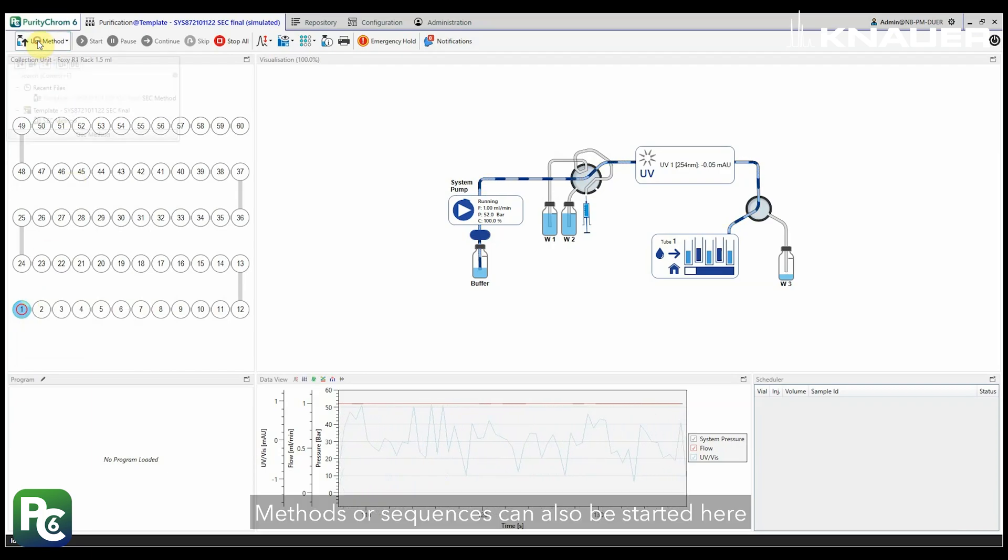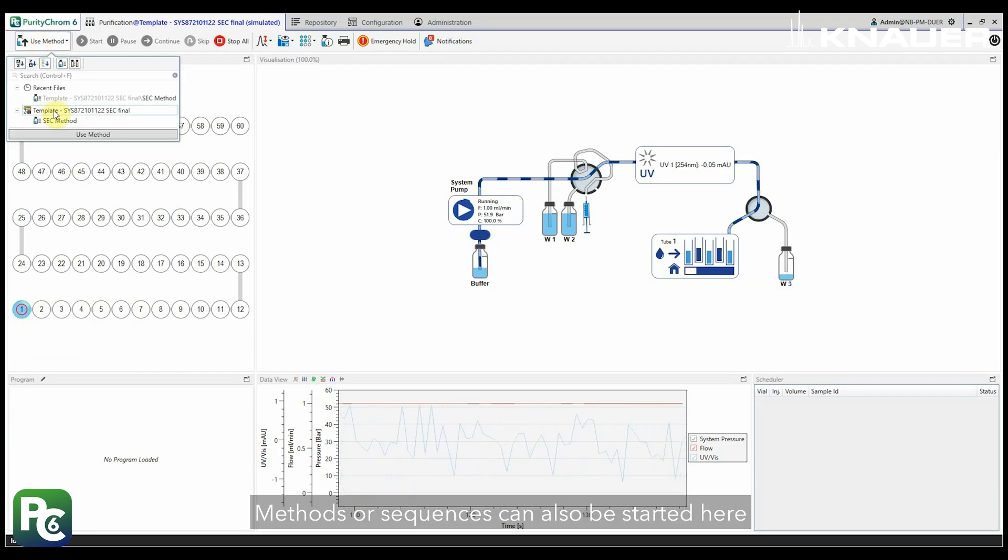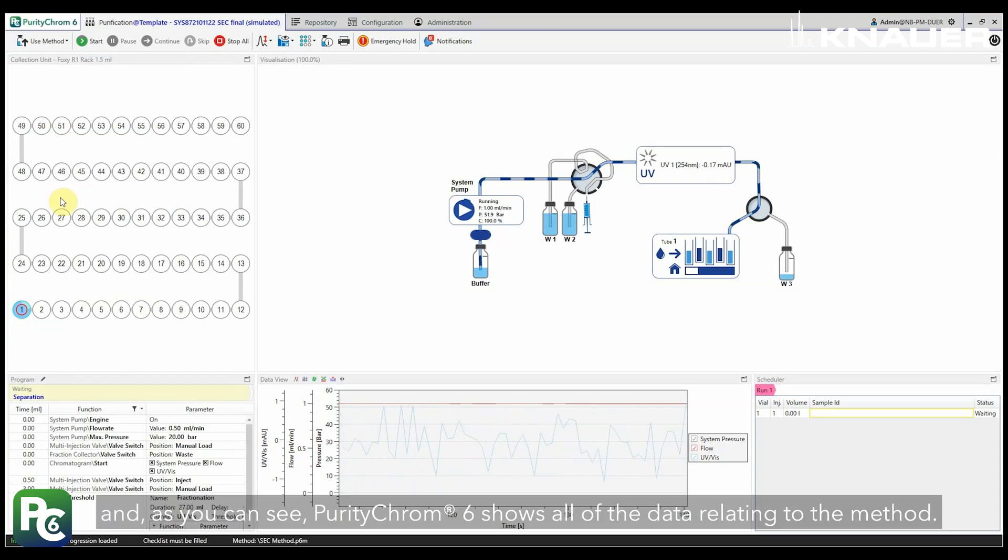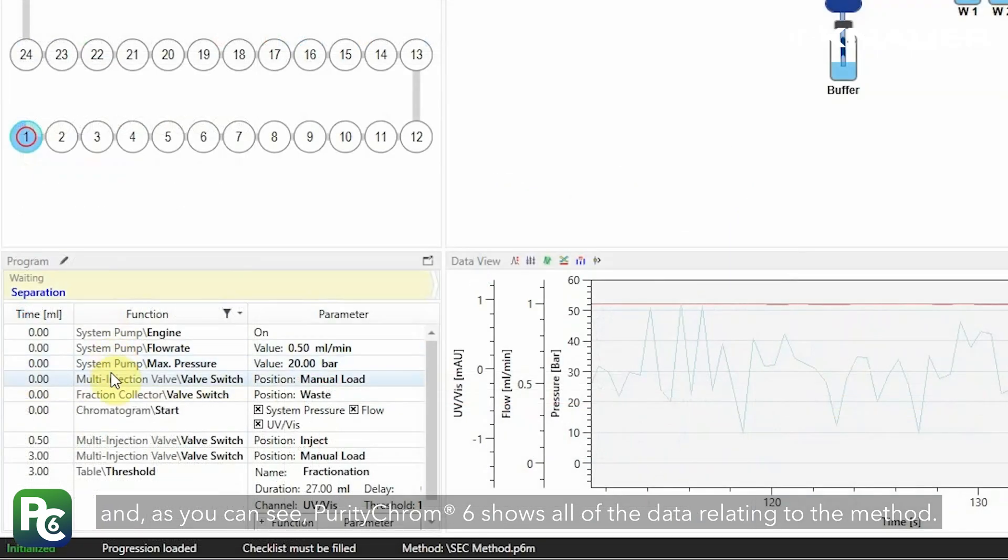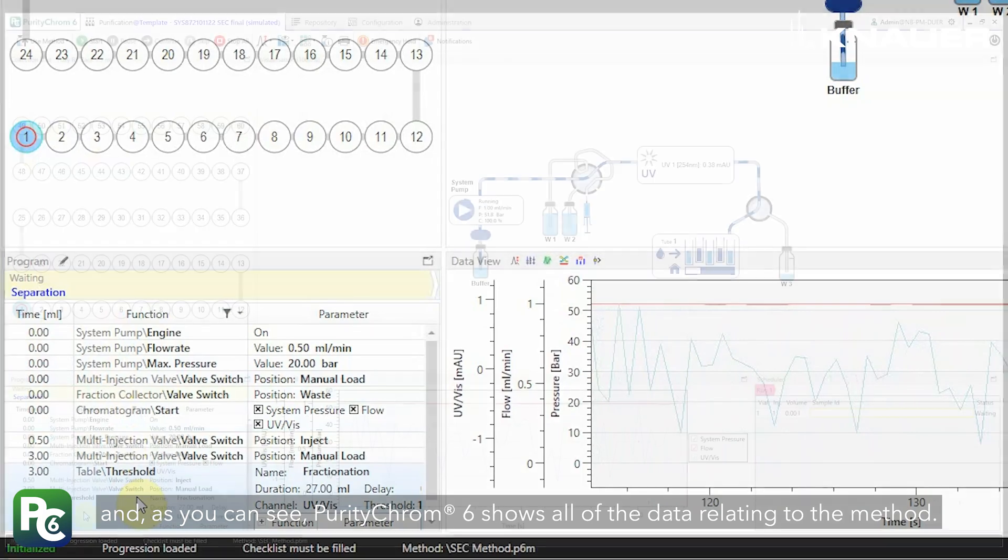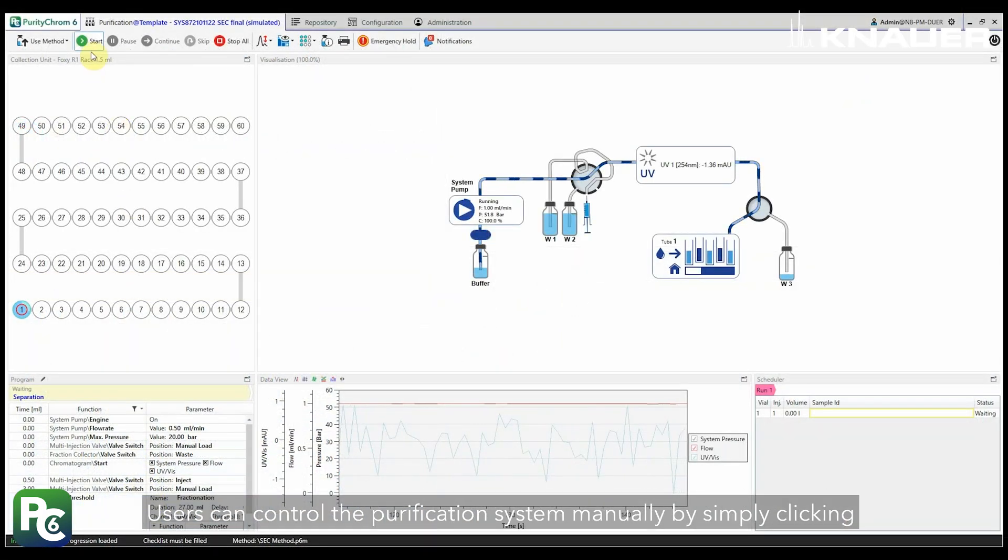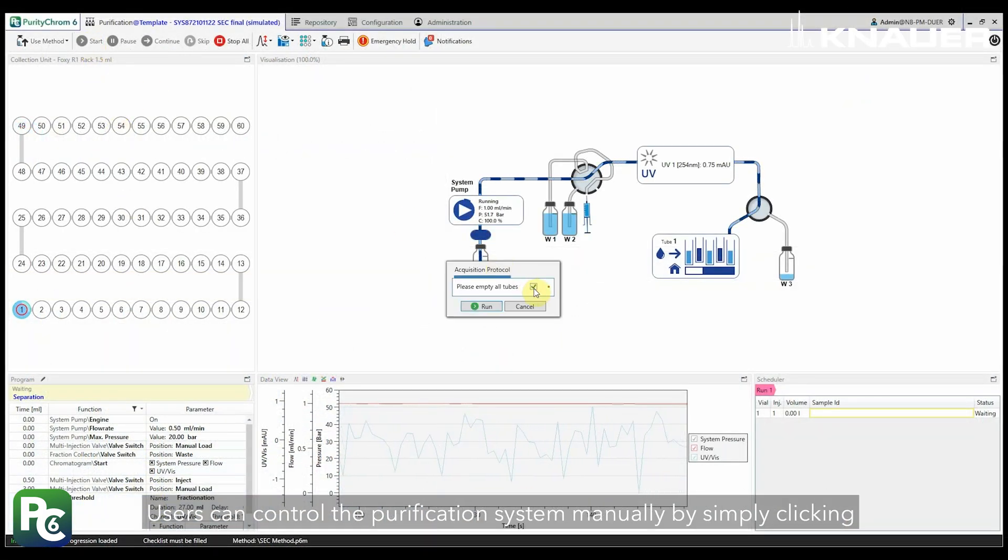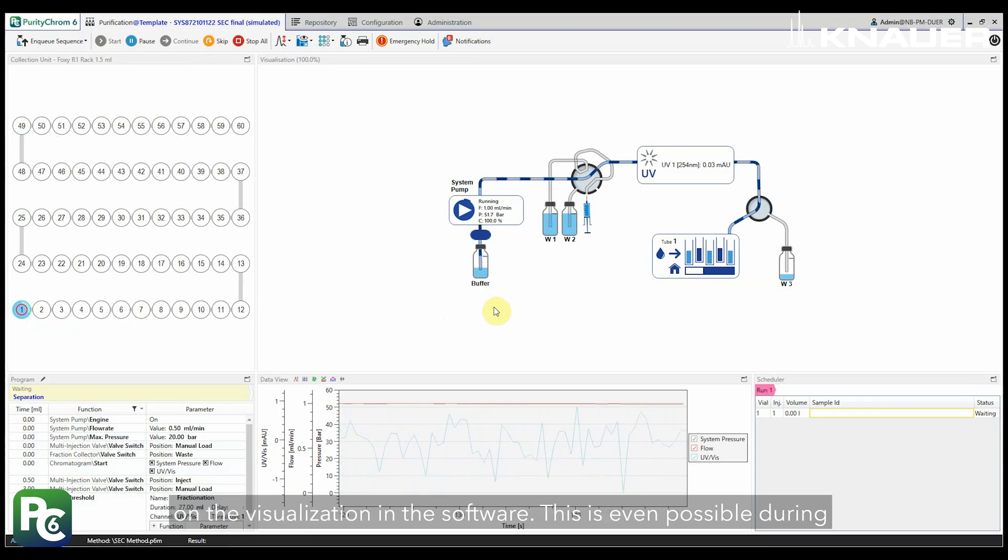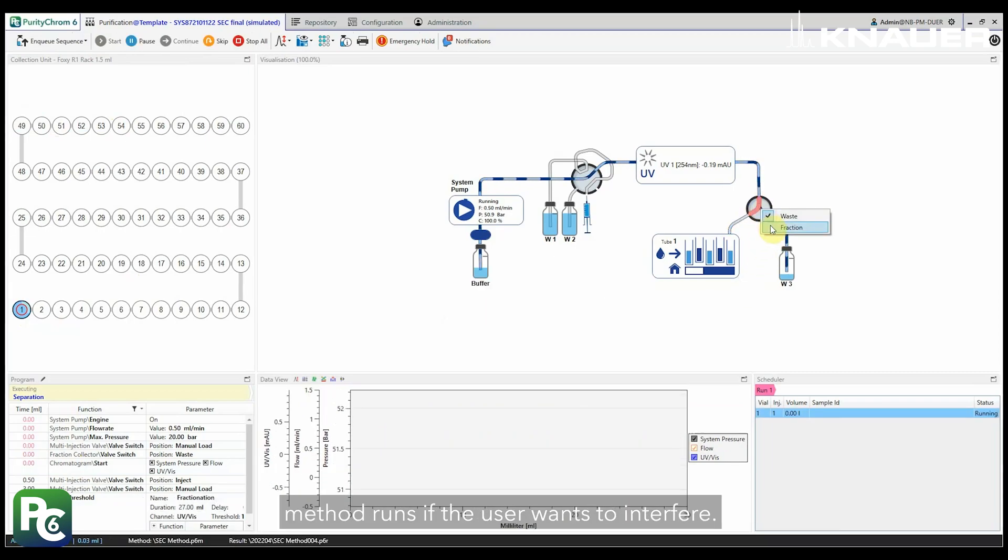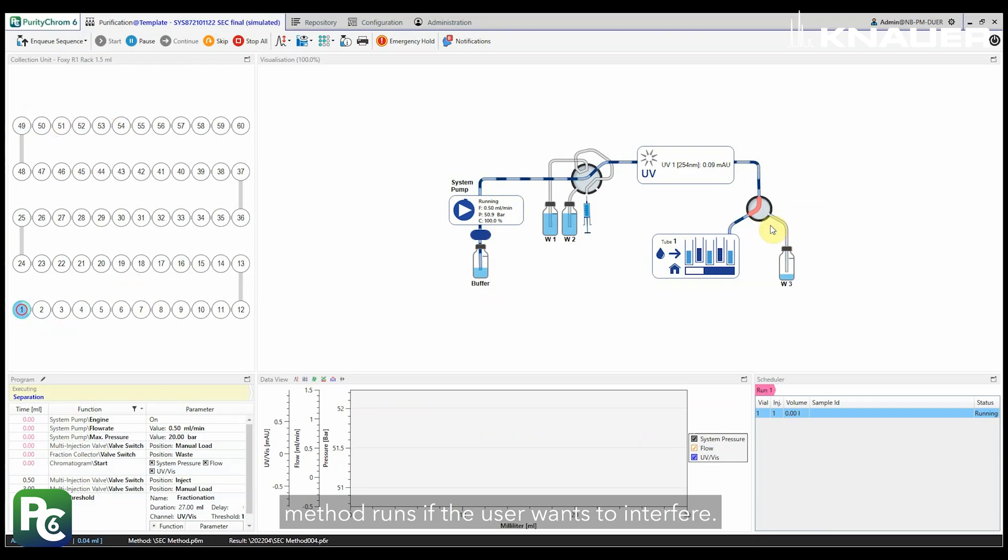Methods or sequences can also be started here. And as you can see, PurityChrom 6 shows all of the data relating to the method. Users can control the purification system manually by simply clicking on the visualization in the software. This is even possible during method runs if the user wants to interfere.